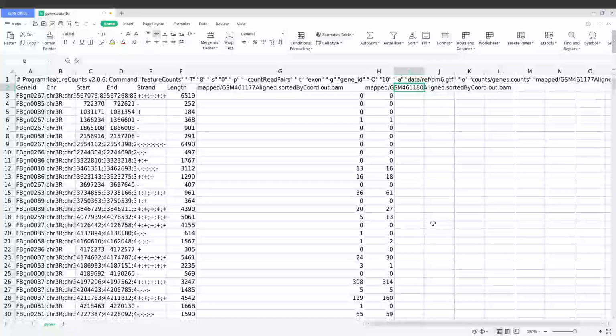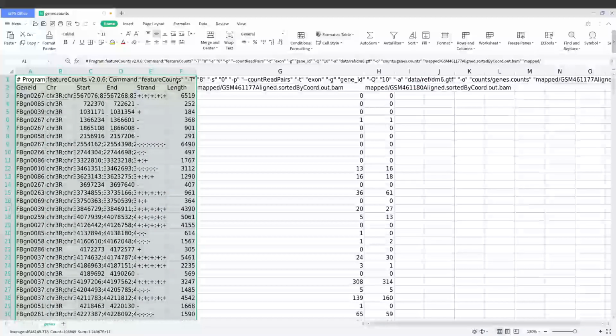So before you do your differential expression analysis, you will need to do some formatting to make sure the naming is okay, everything is fine, and then you extract just the counts, okay, for the differential expression analysis. Now, depending on your objectives, you may need to also do some analysis using the information here. All right, but then for the differential expression analysis itself, it is the count that you use. Also, for that one, you need to do some further processing.